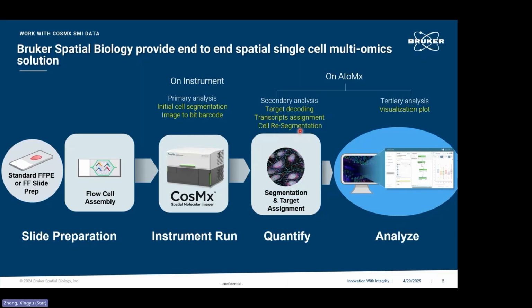After the secondary data analysis, the data matrix will be generated, and then we will move forward with the tertiary or visualization data analysis. All of this secondary and tertiary analysis will be done in AtoMx. But today, we will talk about the workflow.